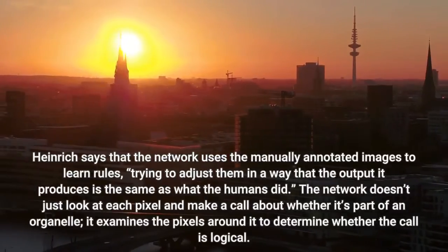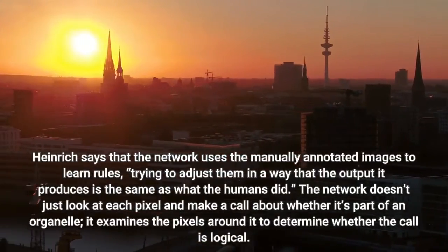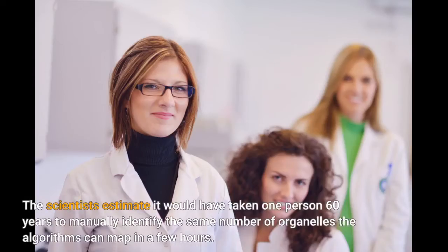The network doesn't just look at each pixel and make a call about whether it's part of an organelle, it examines the pixels' surroundings. The scientists estimate it would have taken one person 60 years to manually identify the same number of organelles the algorithms can map in a few hours.